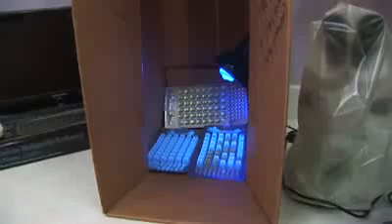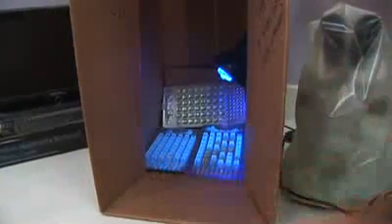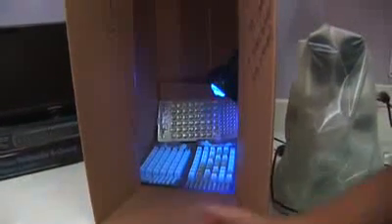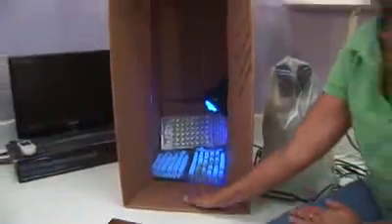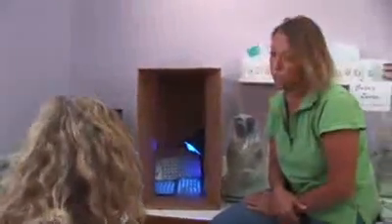All of the large cells are glowing, and only a few of the small ones are not glowing. So this is going to be a much higher number from what we were seeing at the first well. According to the EPA, these samples would be enough to close a beach, stop water being used if it was in a water supply. It would be a state of emergency. And it's my conclusion that this is very indicative of a state of emergency in Bonaire.